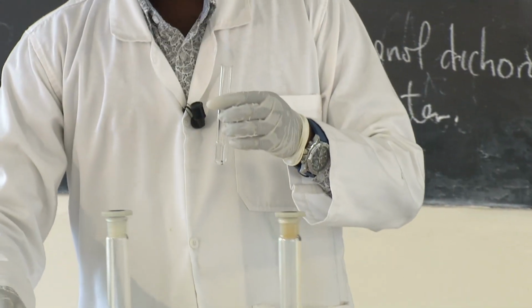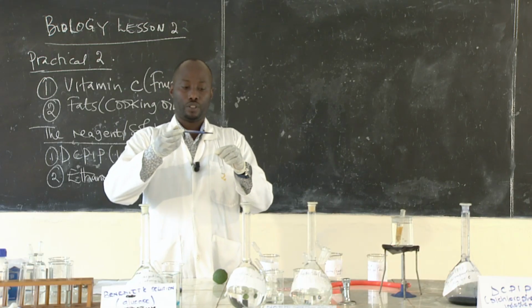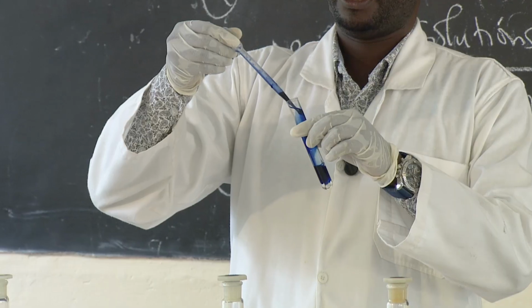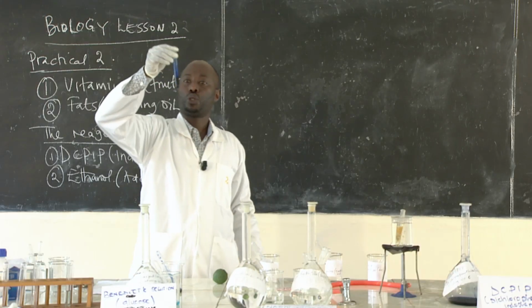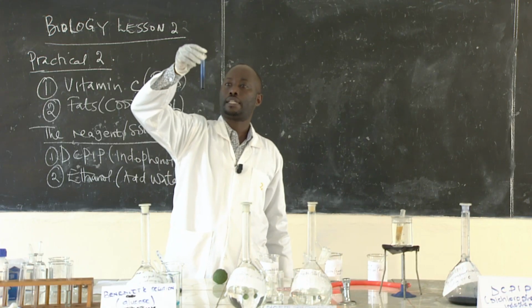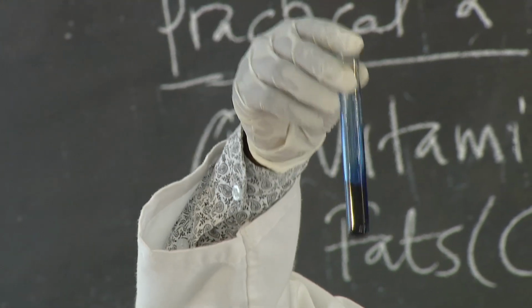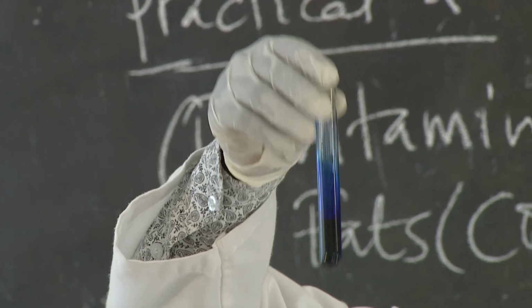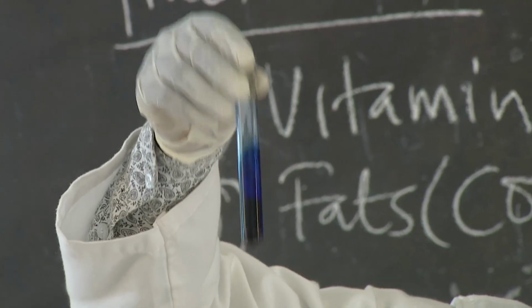Let me also do a control experiment about that solution. I add my DCPIP. If I add DCPIP in the solution, let us check and see. Does that solution, as a control experiment, change to colorless? Let us try to observe and see.